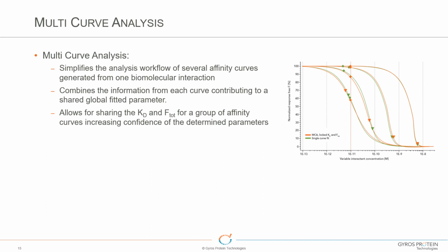And I think what you're doing here is setting up an assay. Once you've identified the fixed concentration for a KD controlled curve and the optimum fixed concentration for a stoichiometrically controlled curve, then you can use those two parameters to run a screening study. We'll show how you do a screening assay once you've identified the optimum parameters. But getting there is the first step, and that's what this multi-curve analysis allows you to do.